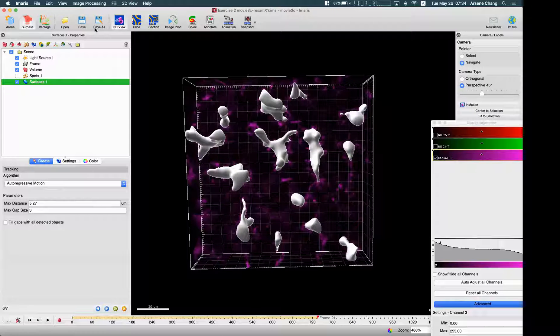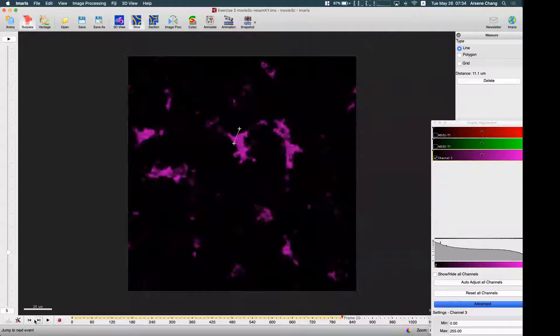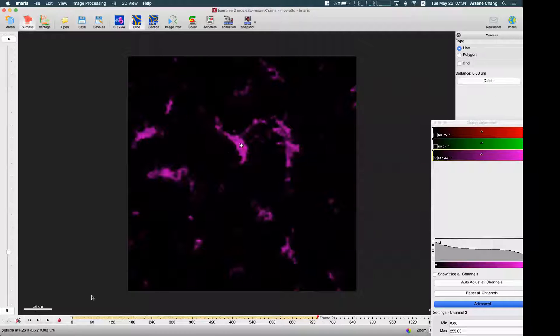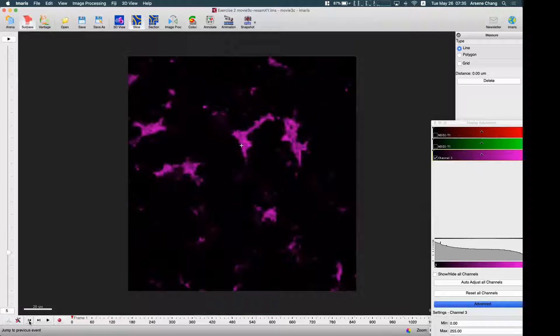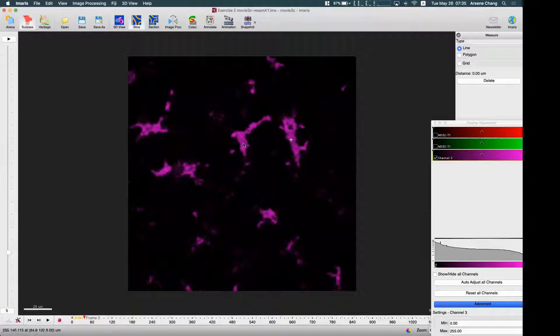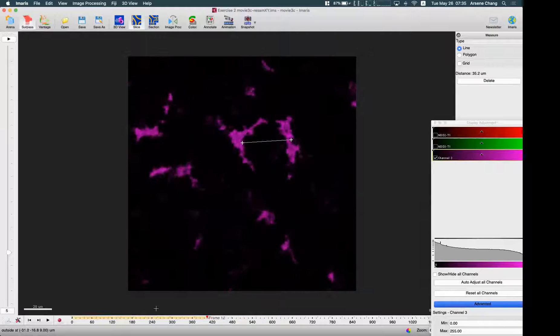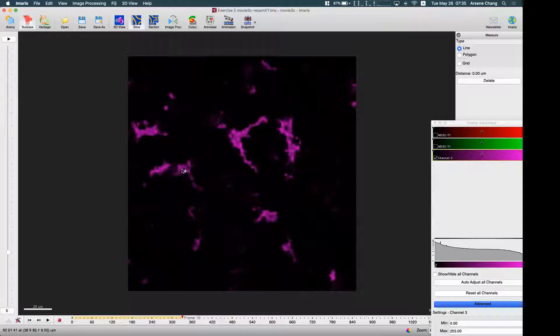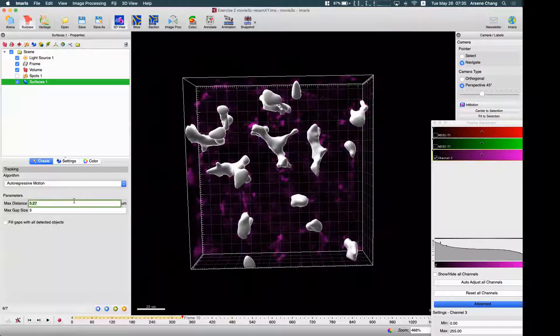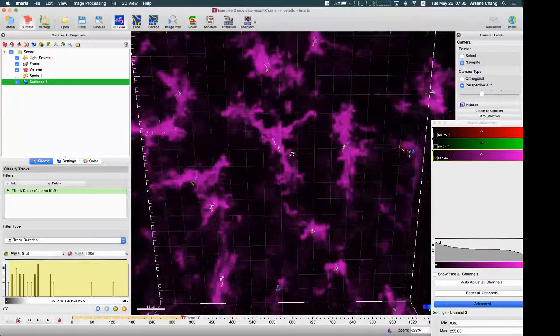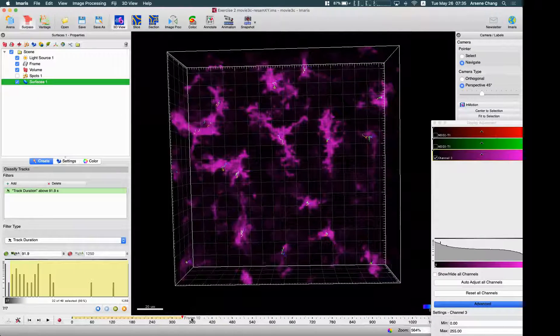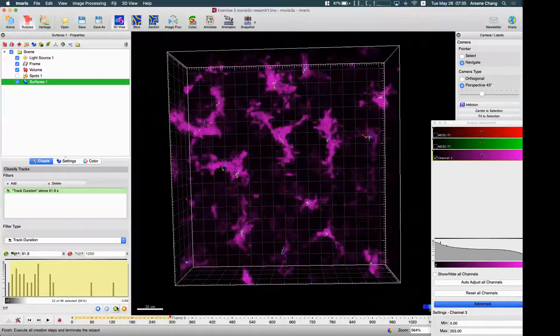I'm also going to use autoregressive motion for the surface. This surface does not look like it's moving, so let me check if I can find some movement. It's basically not moving — very small movement — so maybe I'll use three and two. It's all very short movement and short tracks, which matches our observation. I'll just keep the default result.